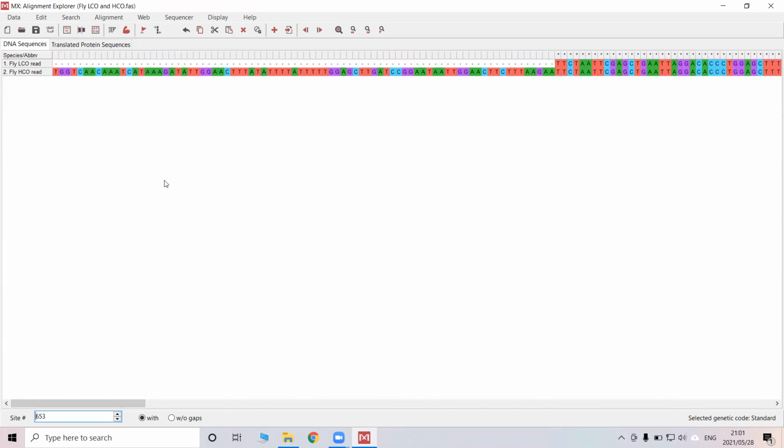One could argue in response to that, since the chromatograms had distinct peaks, we can use these regions with a fair degree of confidence that they should be fine. If the chromatogram peaks for these nucleotides were questionable, then yes, you should not have included them in the first place. But if you process them properly, you can work with this with a fair degree of confidence.